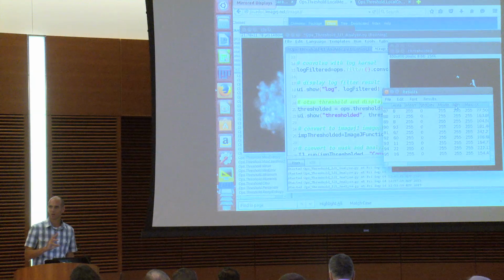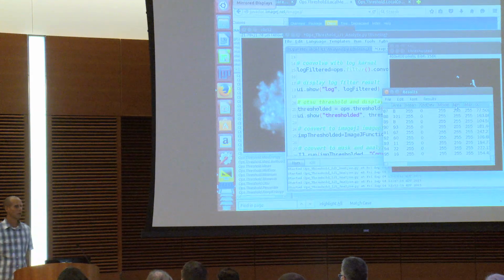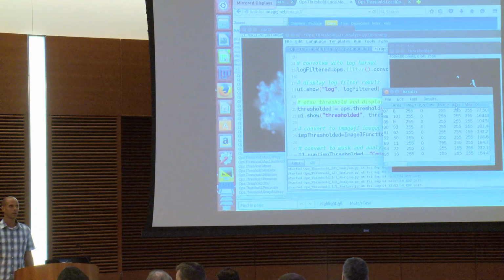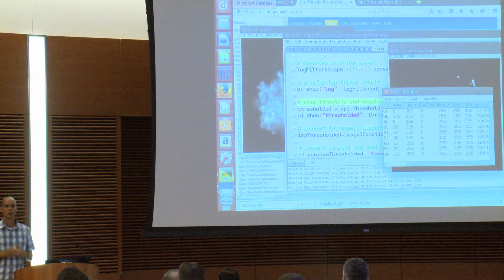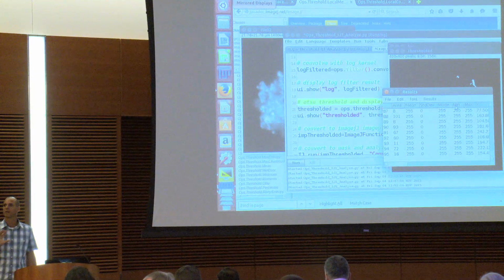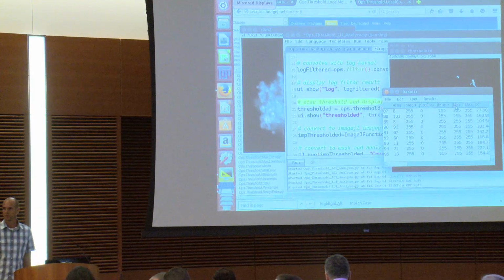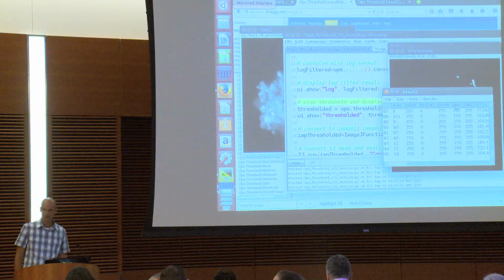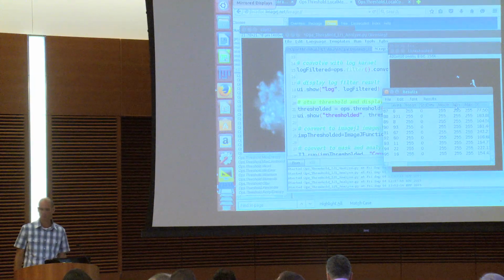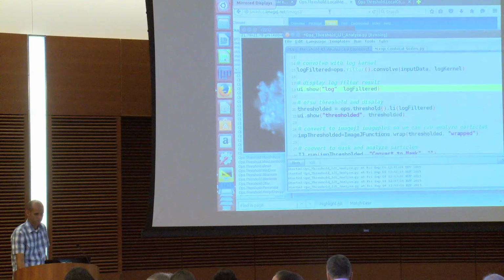And actually, I have a question right now, for you, Curtis. Is there already or going to be some way to, if you know you want to use the threshold ops, have a parameter that gives you a list of what threshold ops are available? Is the parameter harvester going to be aware of an op, like you could actually use an op for the parameter? I think it works now. If it doesn't, I certainly, yes. Like a drop-down list where you choose. Yeah. The only thing is you have to type everything with interfaces. So you should be able to use ops.